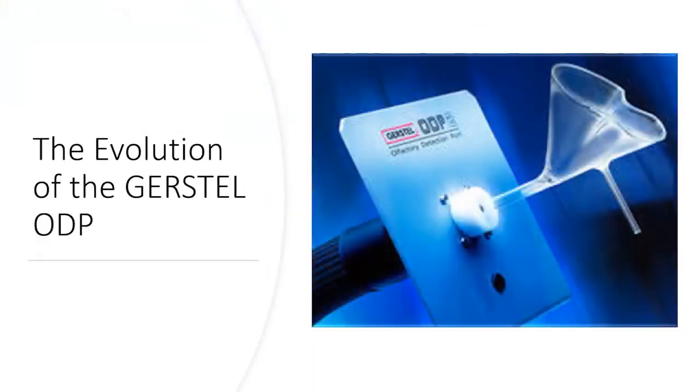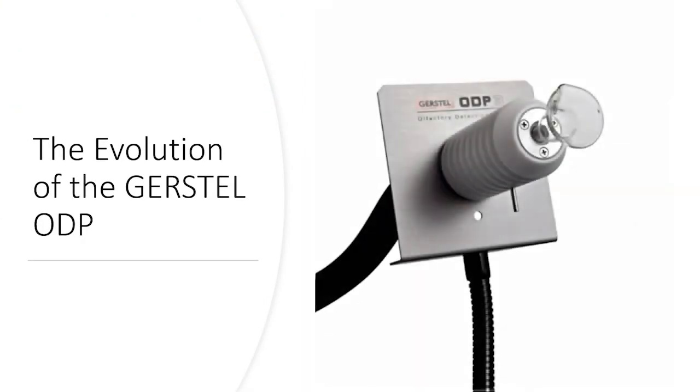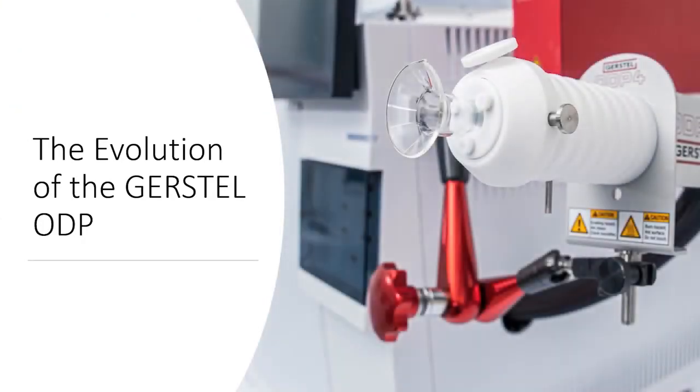The main focus in the development of the ODP4 was the accurate presentation of individual compounds to the human nose, without adulteration, for best possible identification and determination. It is important to note that extensive user surveys have been incorporated into this 4th generation.